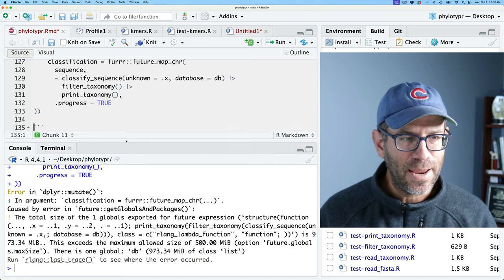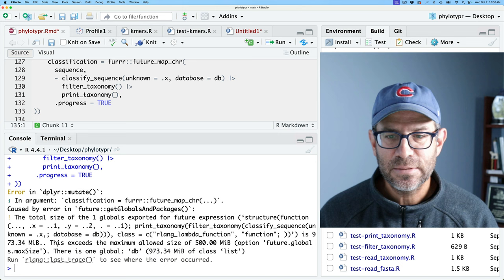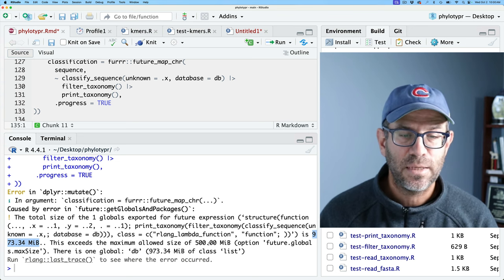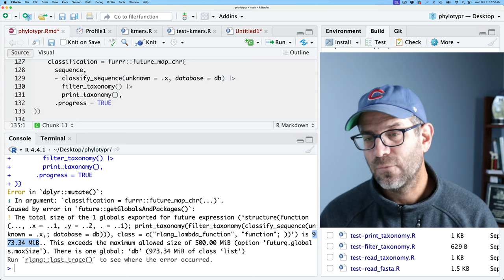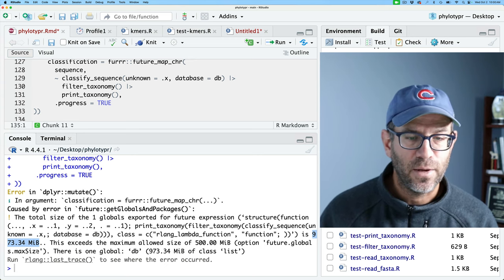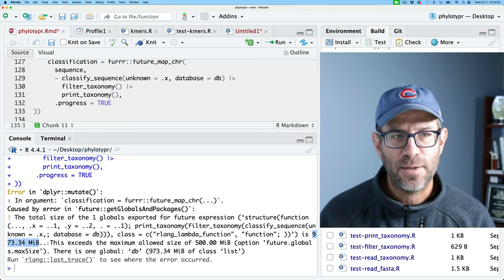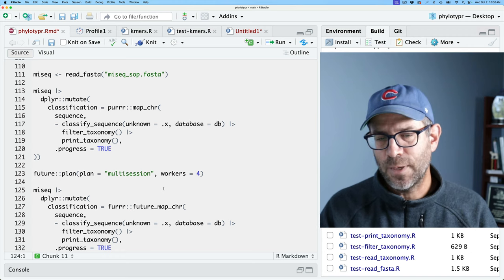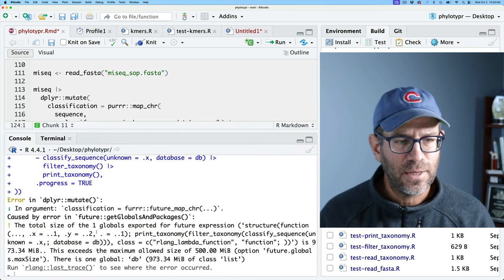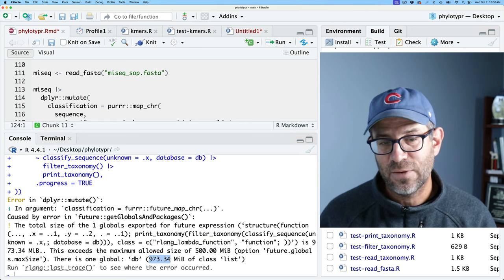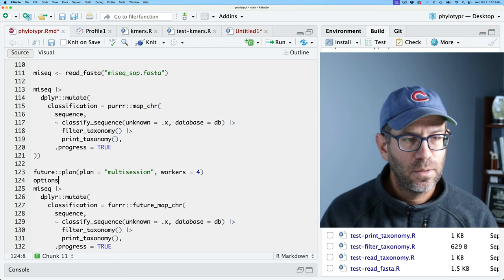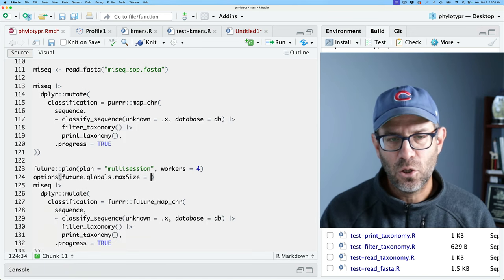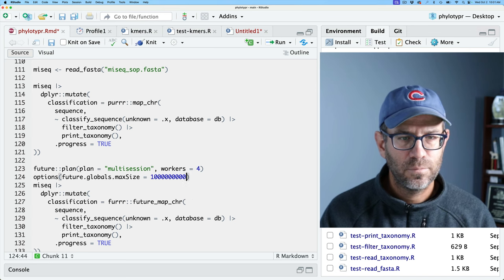Right off the bat it's giving me an error - it's saying that the database, the data I'm using, is 973 megabytes which exceeds the maximum allowable size of 500 megabytes. The option future.globals.maxSize can be modified. So we need to change that parameter and tell future to trust that we're using this bigger object. The cap it's putting is 500 and we're at 973, so we need to increase that. We'll do options and grab the option it wants us to use, and I'll put in a large number - 10 billion - and now let's run it again.